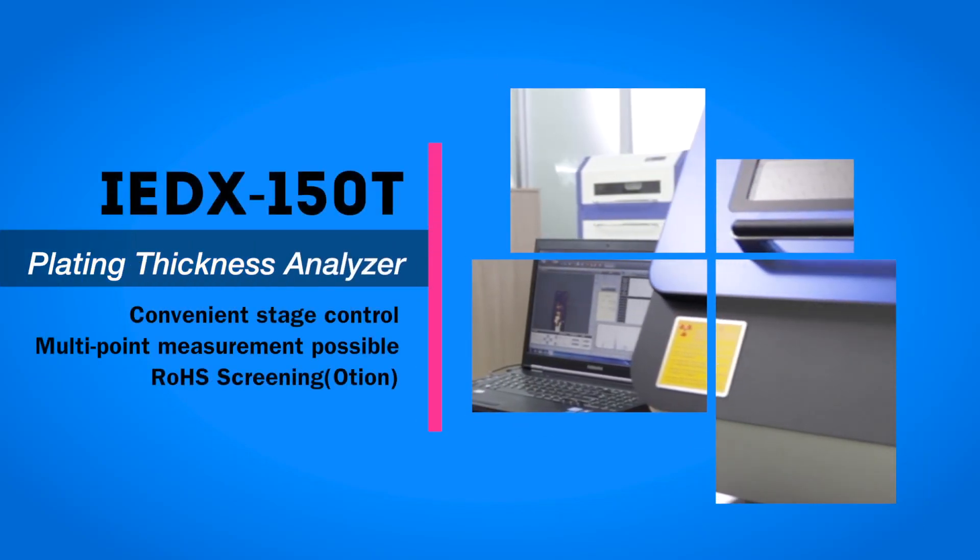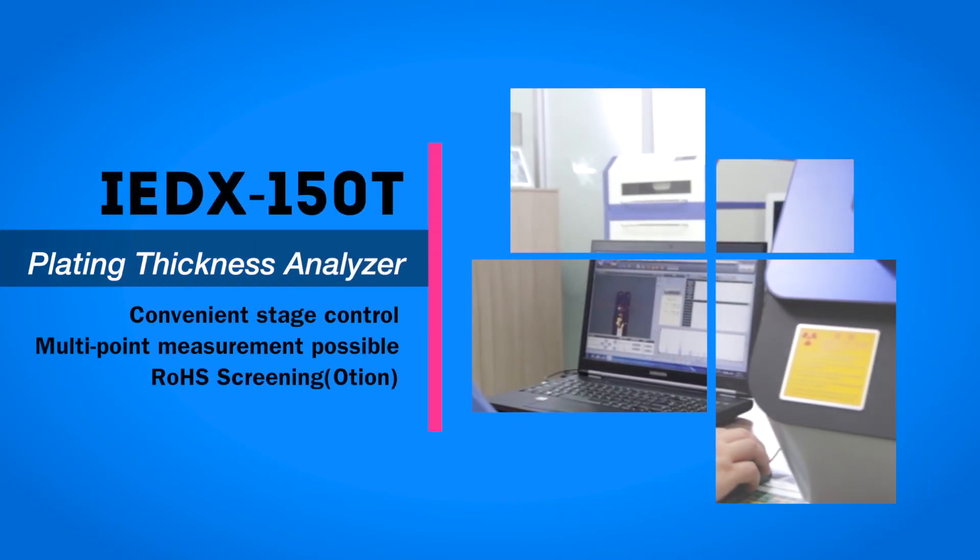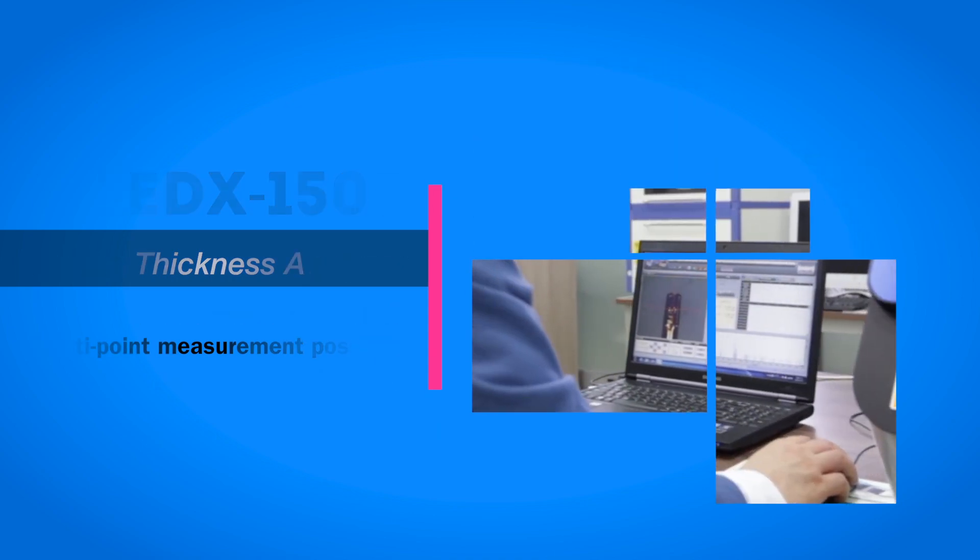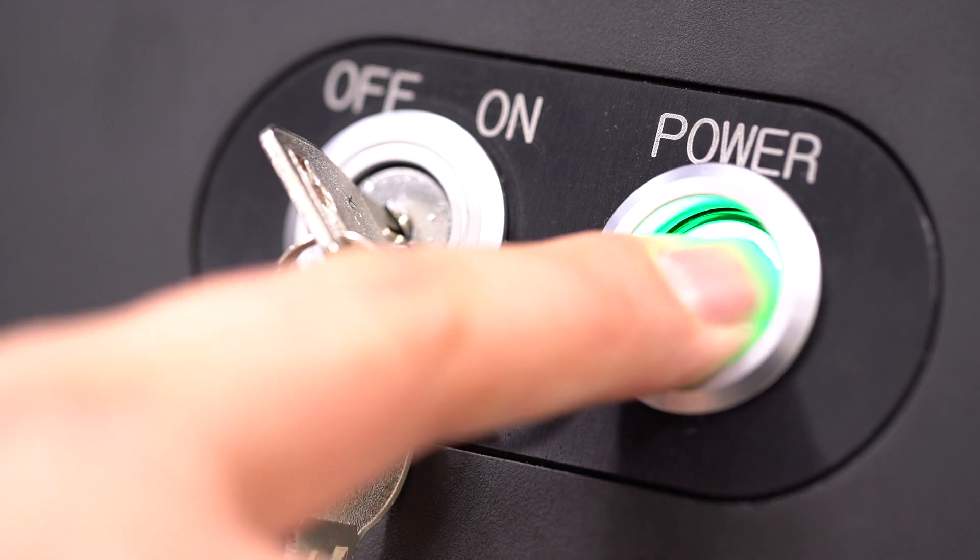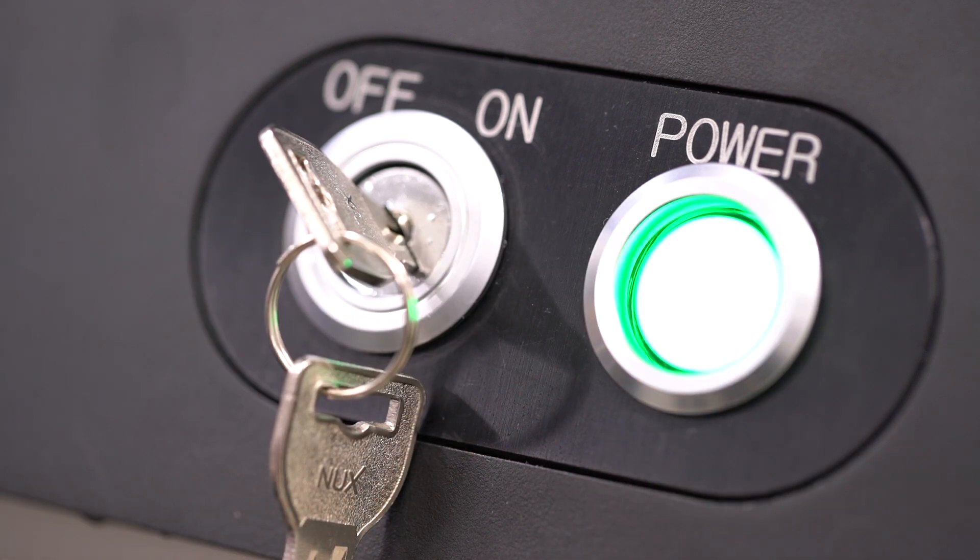This is how to use the IEDX150T. Turn on the power button first. Device installation starts.